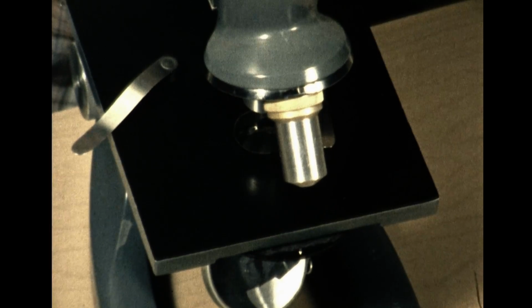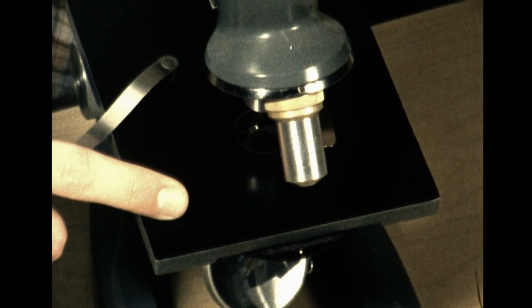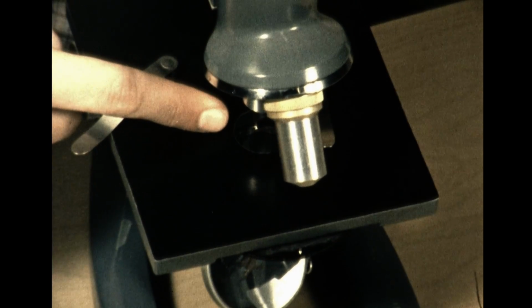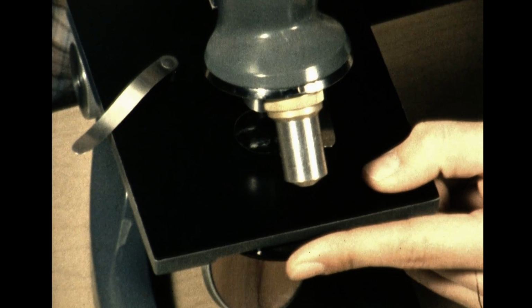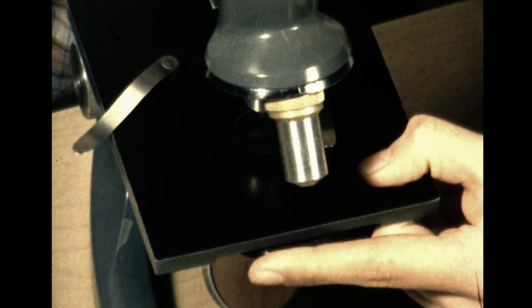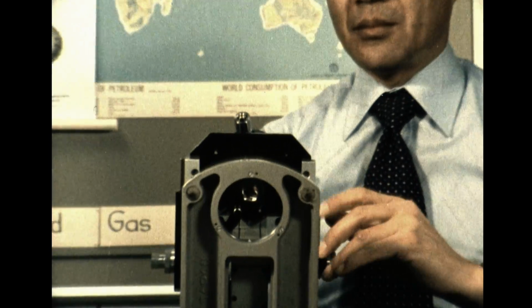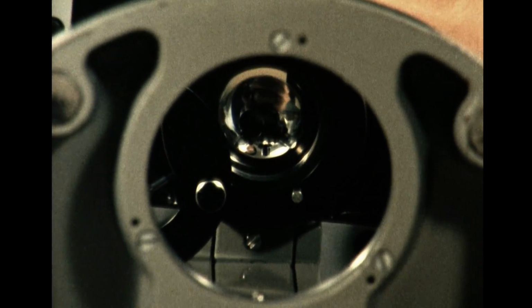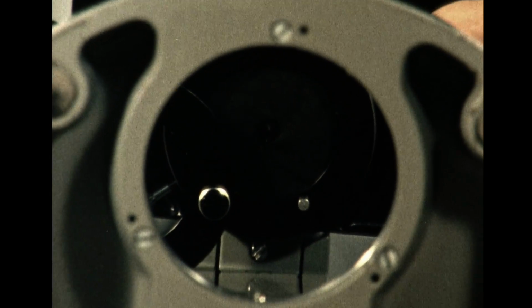The specimens to be examined will be placed on this table, or stage. It has a window in the center. A diaphragm will control the amount of light passing through this window. There are instruments equipped with an iris to control the light intensity. Low power magnification requires less light than high power magnification.